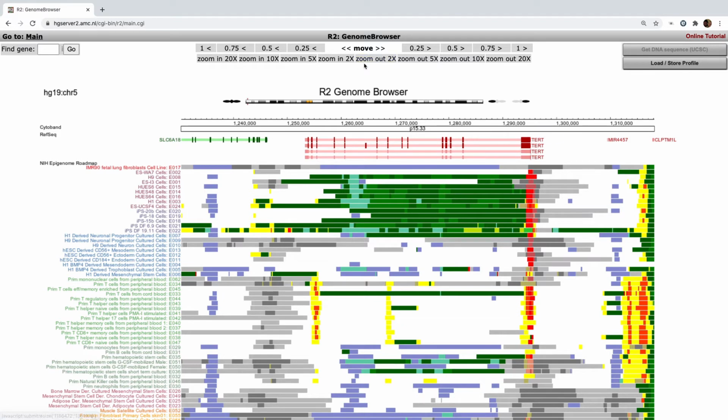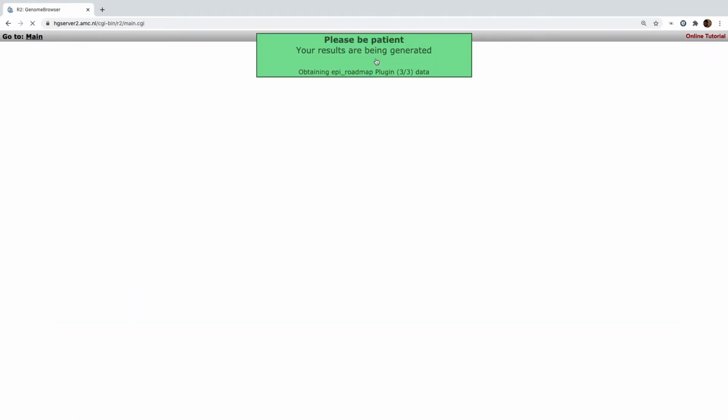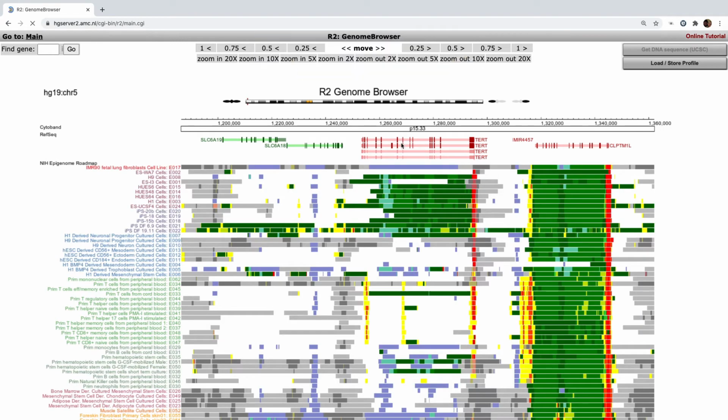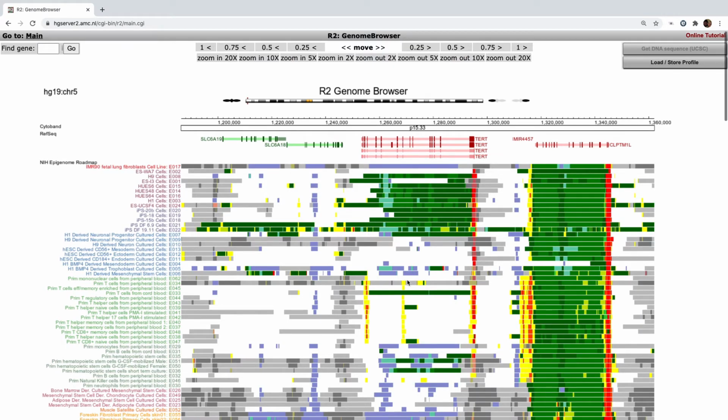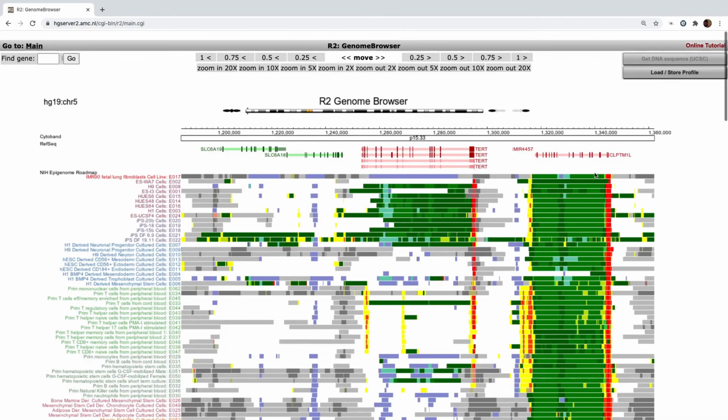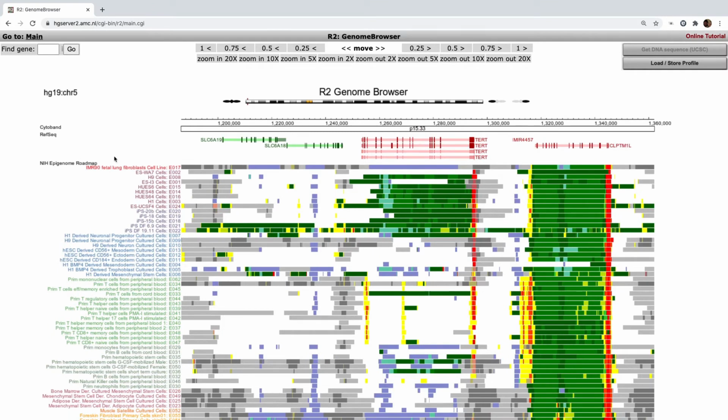itself. If we zoom out a little bit, just to further demonstrate the difference between genes that are only partially active in certain profiles and those that are generally expressed in a broader overview of profiles, here you can see that the genes that lie next to the TERT gene are actively transcribed basically unanimously across all different profiles that we have.